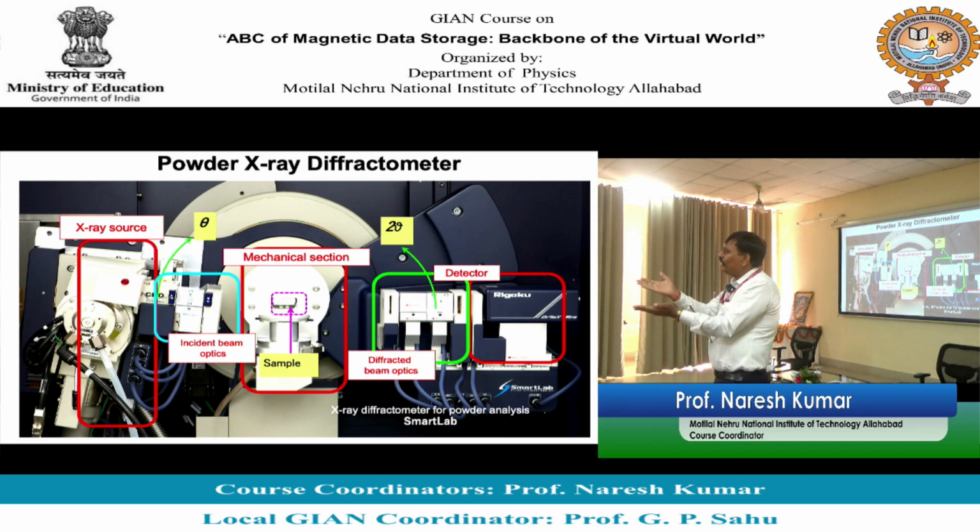X-ray आई, जिस भी d वैल्यू के लिए कंडीशन सेटिस्फाई हुई, क्या मिलेगा मुझे, एक पीक मिलेगा. अब थीटा बढ़ाते रहिए, मैं सेकंड थर्ड की बात ही नहीं कर रहा हूँ. So for every value of angle of incidence मैं केवल फर्स्ट ही कंसिडर करना चाहता हूँ. क्या मिलेगा मुझे, I will observe what, पीक. कितना पीक मिलेगा, 1 2 4 5 6 कितने, I will get only one peak. If I consider second, third order, I will be getting more number of peaks, but their intensity will gradually go down. अब एक और तरीका ढूंढ लेते हैं हम लोग.